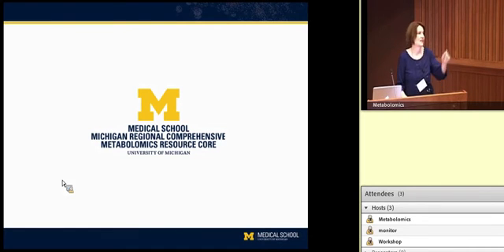Okay. Steffi. Regarding that extended targeted assay, I didn't quite catch how much you did with the data. You report the areas, right? Do you normalize them at all? In this case, you don't have standards, right? Right. We could use an internal standard eluting around the same time as that compound. So it would be an approximate normalization between samples, but not an absolute normalization, because we don't have an internal standard for that compound. Correct. So, go ahead.